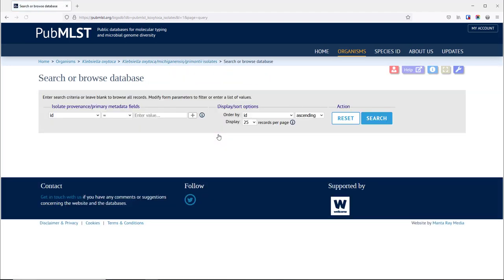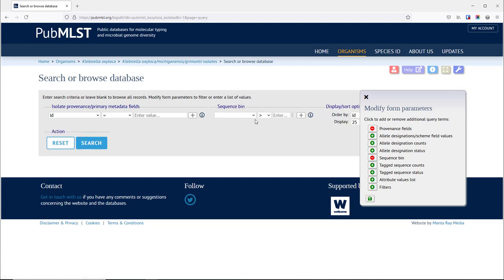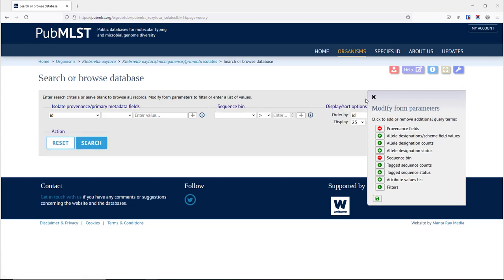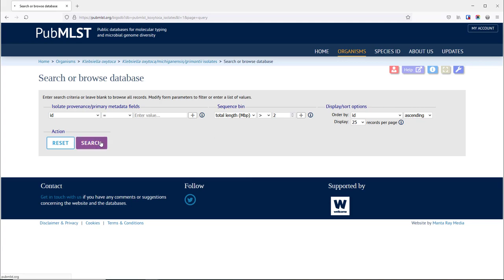If we search the database for genome assemblies, we've modified the form and we can search on the sequence bin greater than a total length of two megabases.